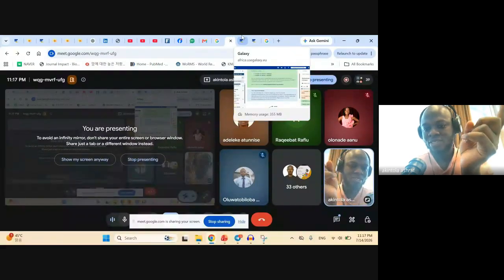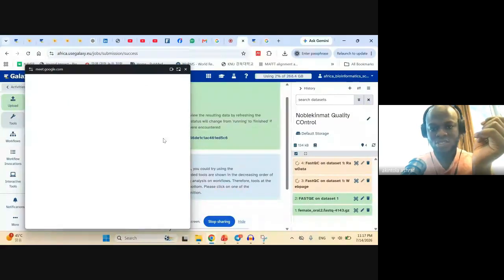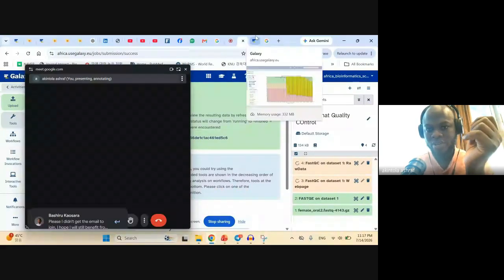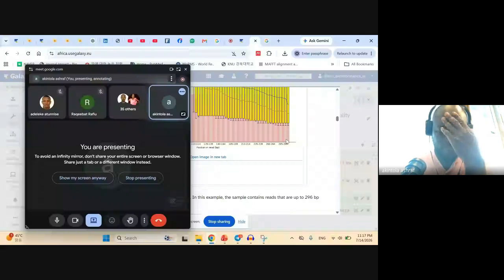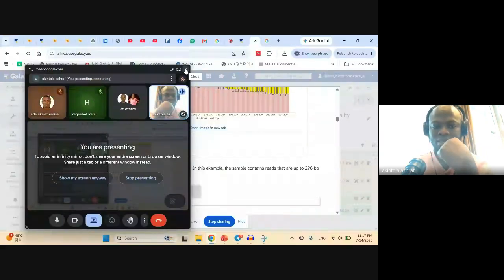And while we are still waiting for the analysis to complete, there are other tools to do. Now that one we have seen, don't worry.